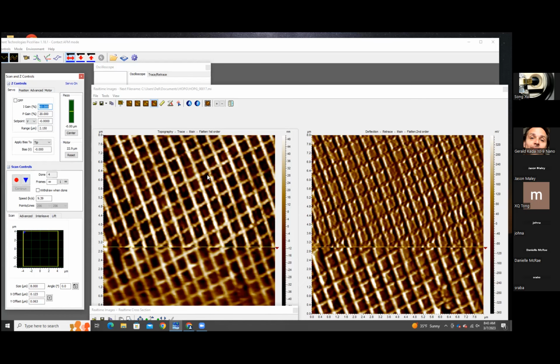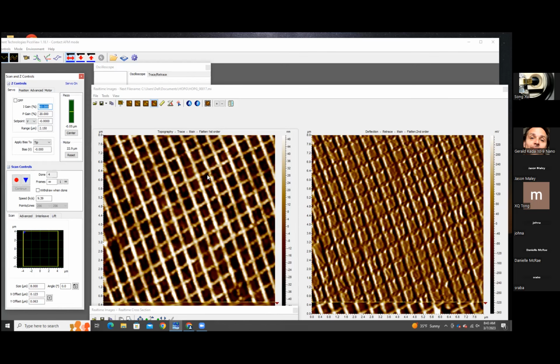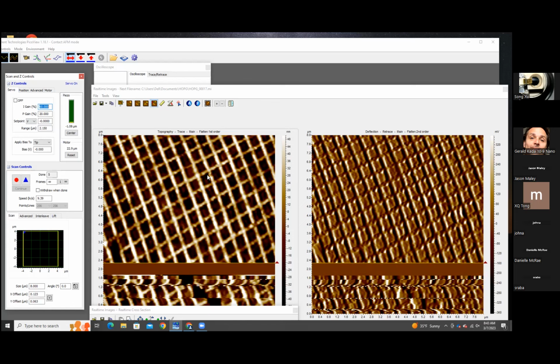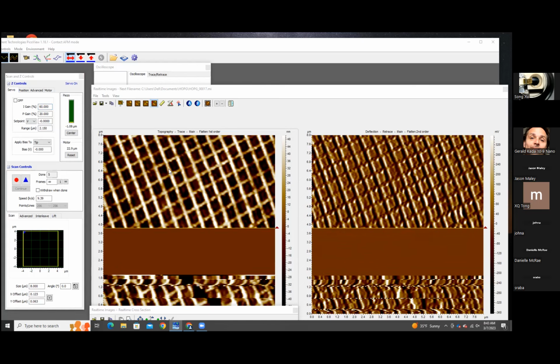Okay, next, I'm going to mimic some kind of problems, and anybody in the audience can tell me what's going on. What did I do? I just observe what's happening. Okay, why did it disappear? What happened is that I just manually withdrew the sample. So the sample is too far away now.